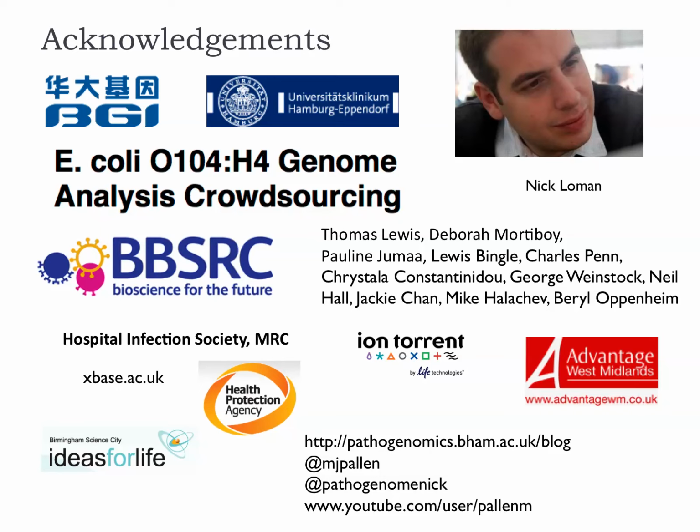So in a broad sense, finding the kinds of adhesins, the kinds of toxins and other things that you recognise will obviously inform your thinking. But often you'll find things hidden in the genome you didn't even recognise were virulence factors, and it's very hard to tease it out. And even when you do, genome sequencing is quick and easy. What Nick disparagingly calls experimentomics. Actually going and doing experiments and hypothesis-driven research to show what you've seen in that genome really is what you think it is takes months or years of postdoc and graduate student time to work out.